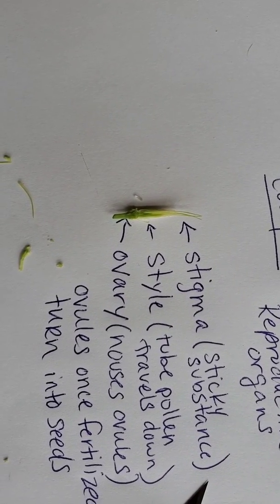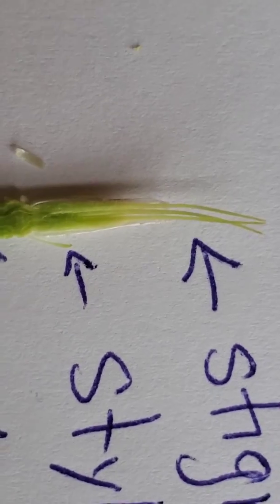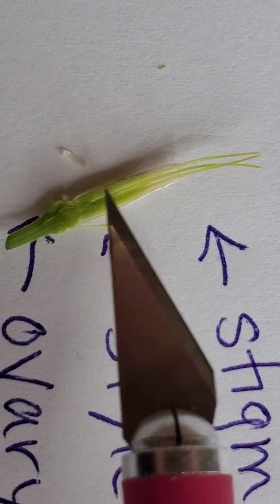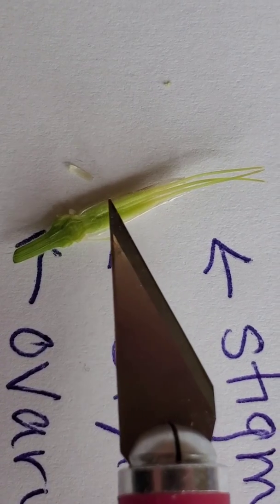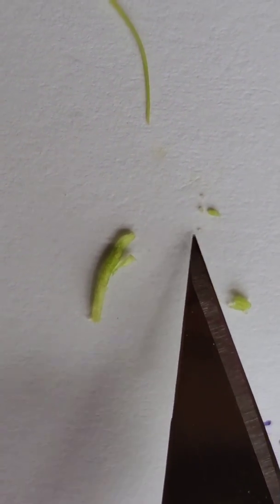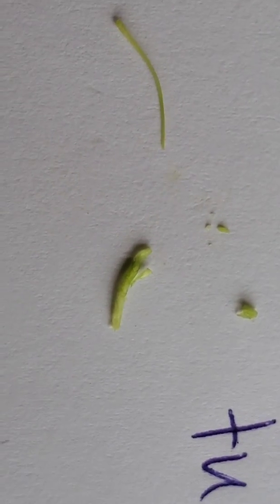Okay, so I'm going to try to zoom in a little bit so you can maybe see. I'm sorry, I'm trying to figure out where my knife is. You can see this style. Each one of these is an individual tube, so you've got your stigma on this one, and it's going to go down to the style and then into that ovary. I tried to scrape some out, but it's really hard because there are super tiny little ovules inside of there that would then turn into the seeds.